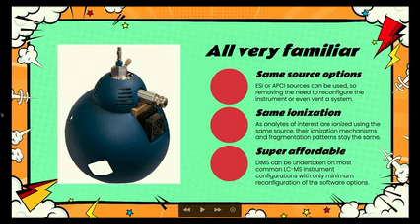The benefit of direct injection is you've got the same ionization mechanism, so you've got the same source conditions, and the same in-source fragmentation issues, those types of things, occurring. So there's nothing mysterious going on there. So it can make understanding the data a little bit easier.